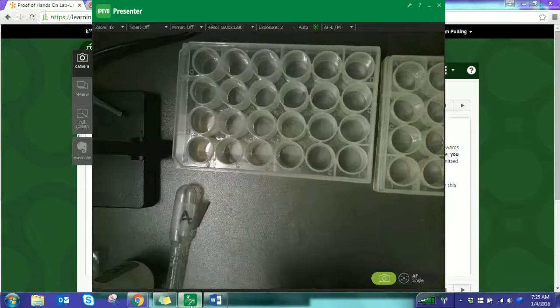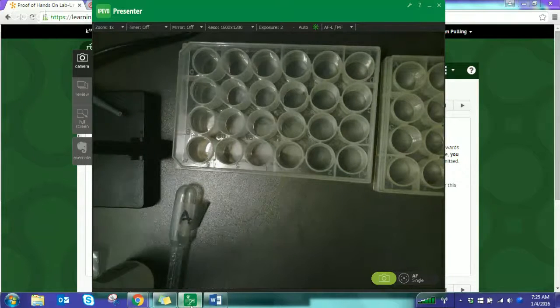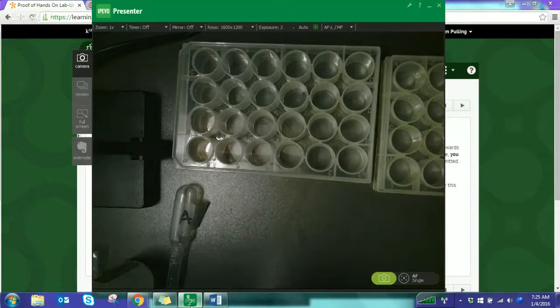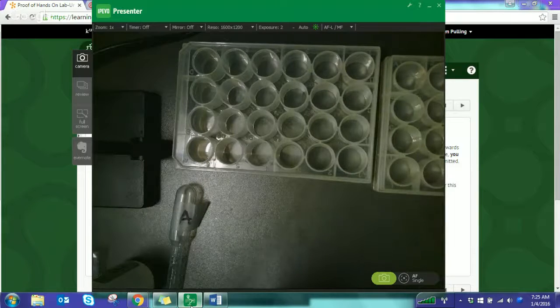And then you're also going to use water, which if you have distilled water, that is best. Again, if you don't have access to distilled water, maybe buy a bottle of water and just use that in place of distilled water. Because you can get distilled water, a gallon of it, for about $1 from the grocery store. It's just, you don't need a gallon for this class. But the water is going to go only with the water pipette. Okay?